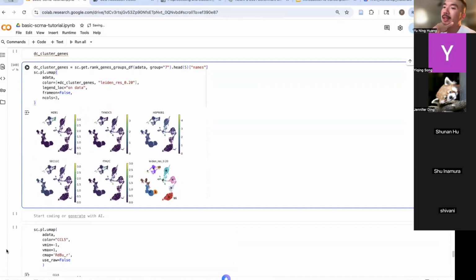So now if I want to interpret this plot, they're just telling us what these top rank genes at group 7 show up here. So this is cluster 7, and these genes all show really upregulated here. So this is just looking at the top rank genes.